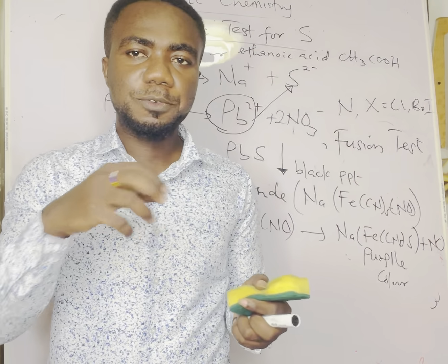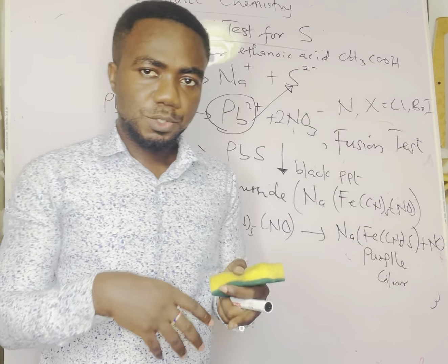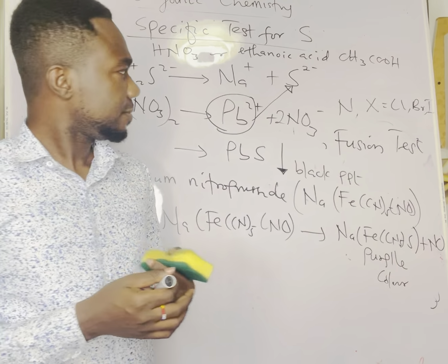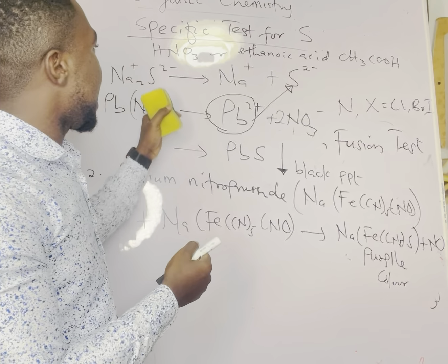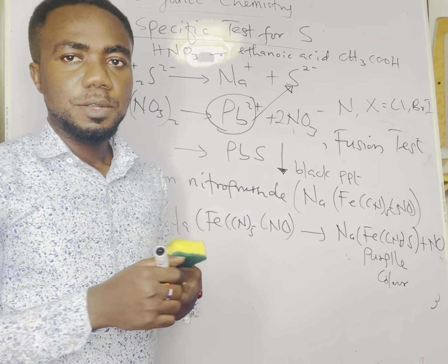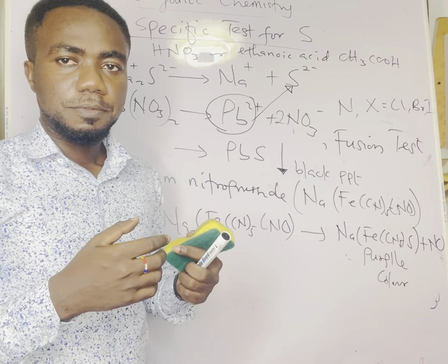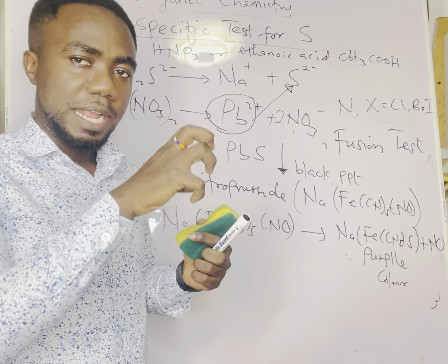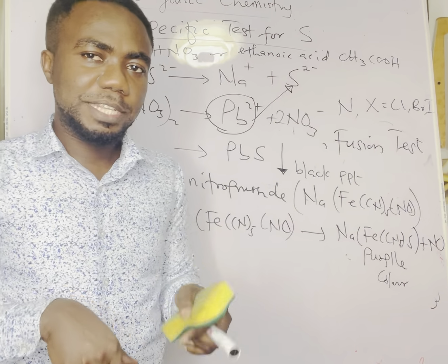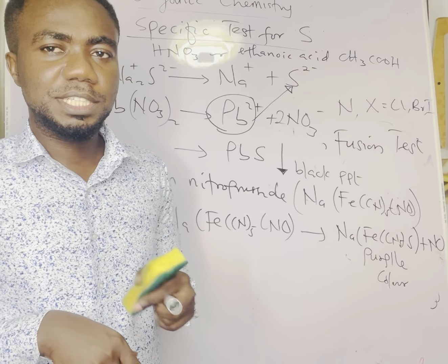The iron sulfate will dissociate, and the iron will react with the OH group. This reaction can tamper with the specific test for your nitrogen.